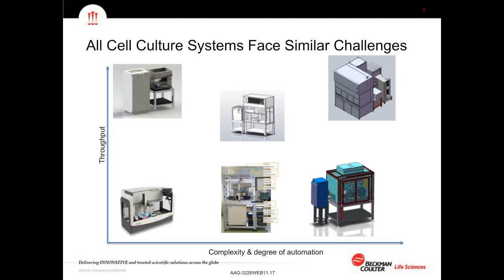And just to highlight a couple of these in particular, that Biomek 4000, we place several of these that really just do simple media exchange for a small number of plates. On the top left, we have what is essentially a straightforward liquid handler attached to a large capacity incubator in order to do a huge amount of media exchange, so for some cell line maintenance activities.